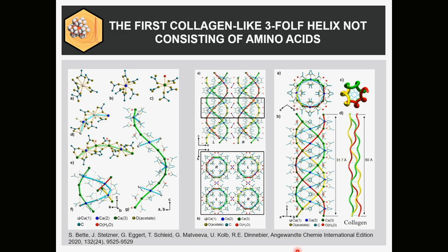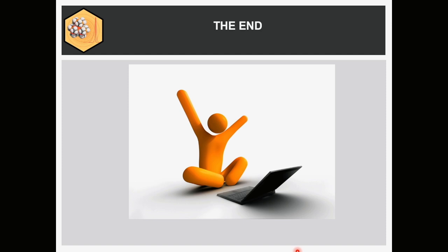It's from powders. Powders cannot do this. It's impossible from powders. And so finally, we know Ute Kolb doing electron diffraction. We finally found the piece which we could use. We went to the electron microscope, electron diffraction. They solved the structure again, and it turned out to be exactly the same structure. So we have this combined paper, electron diffraction and powders. But I just want to show you, powder is very powerful. It's amazing what you nowadays can do with powders. And after the course, you hopefully are all specialists and can do these structure determinations.